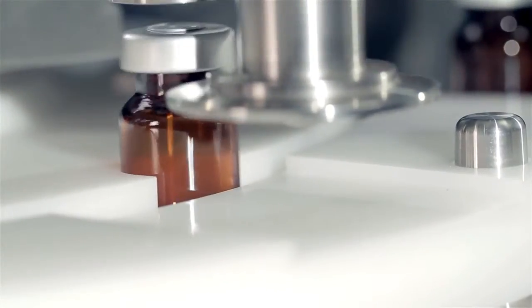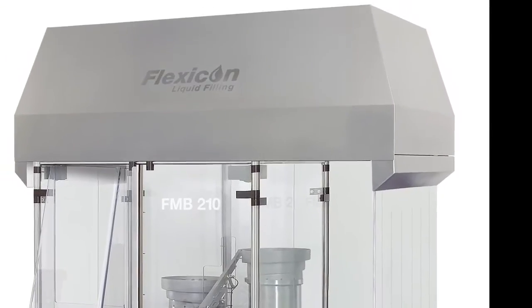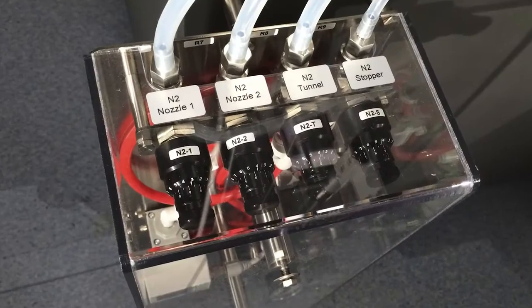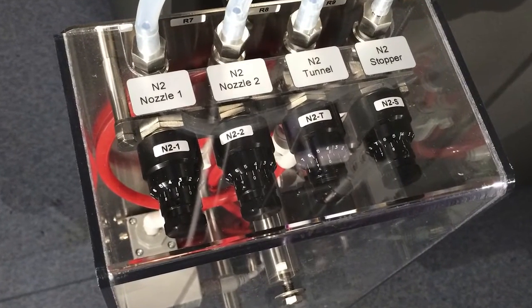Optional modules include a laminar air flow unit which protects open vials from contamination, connection to a particle counter and a gas purging system that minimizes oxygen content in filled vials.